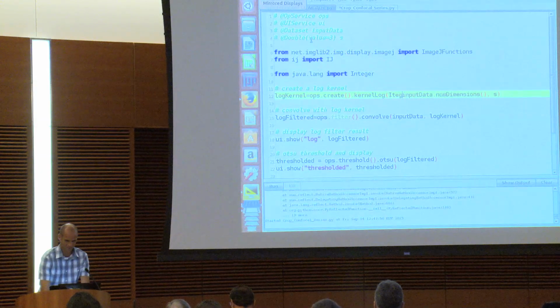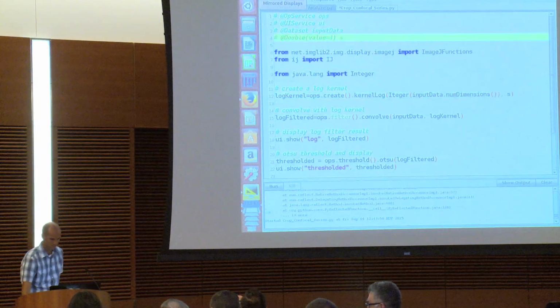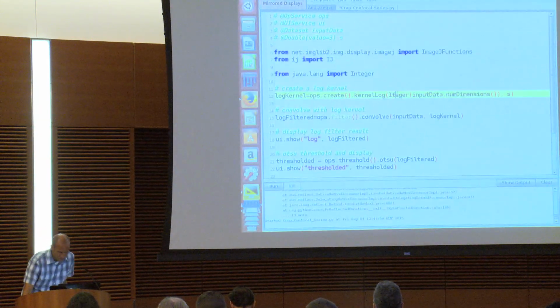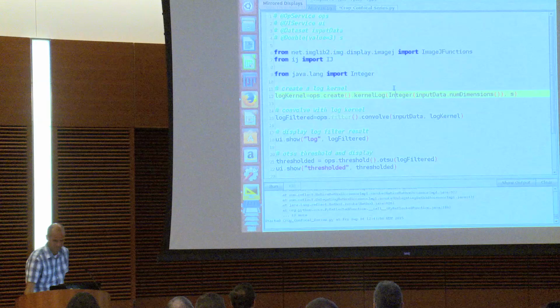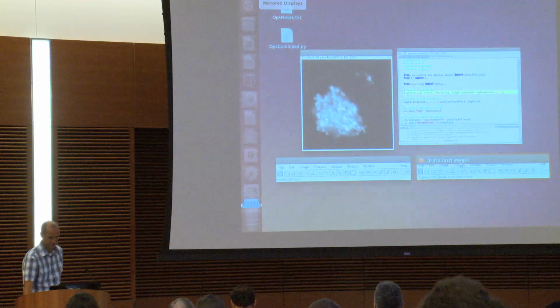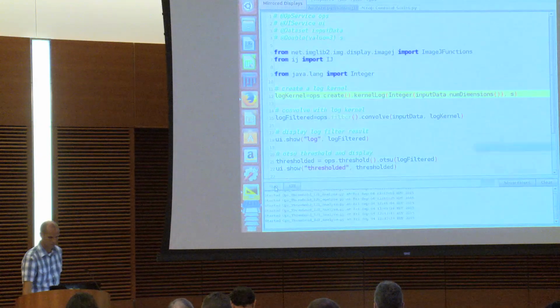This is the two-edged sword of the fact that all these ops have so many different convenience signatures. It's like I can accept all these different kinds of types. So we have integers versus doubles. Python doesn't necessarily deal well with it. So you sometimes just have to get Python fixed. Yeah. So let's run it.